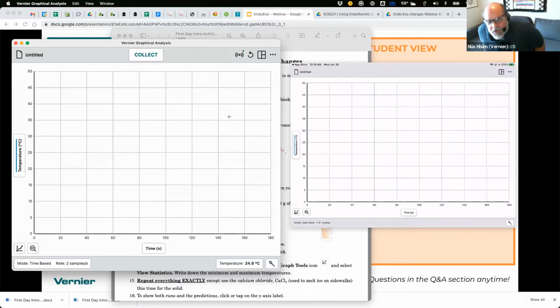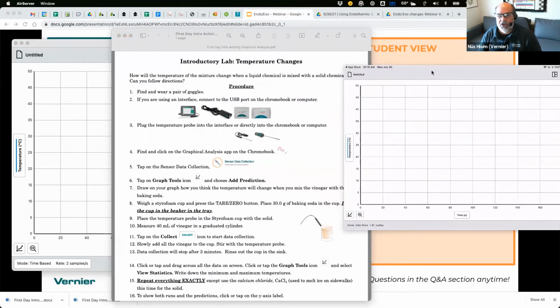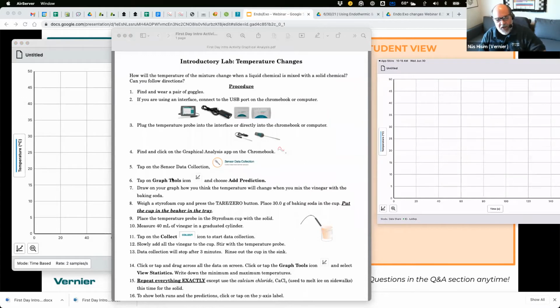But anyway, we're ready. Now your students would not do this, but I wanted you guys to be able to play with me today. So in your classroom, you're not going to do all that. You're just going to put this all out and have the kids do it. So it says tap sensor, we did all that. We've got a graph. Oh, we're going to do a chemical change. We're going to do a temperature change.